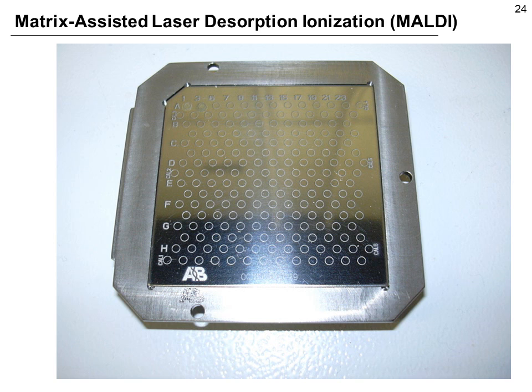As said, MALDI transfers ions from the solid to the gaseous state. To this end, samples are deposited on a so-called target plate as shown in this slide. A target plate essentially allows to crystallize a small volume like 1 microliter of matrix and sample and let it dry and then ready for laser irradiation.